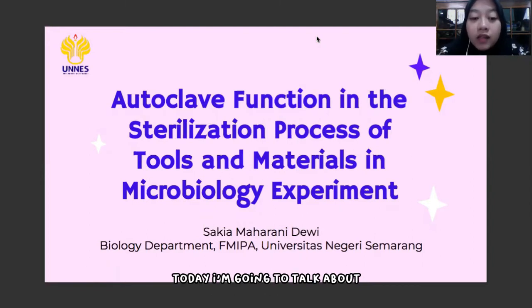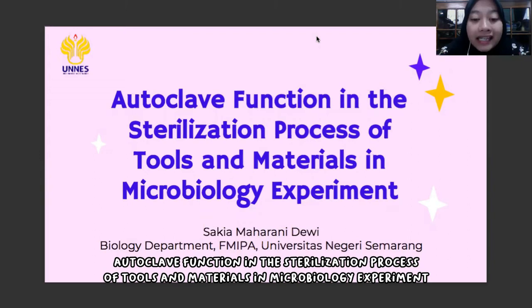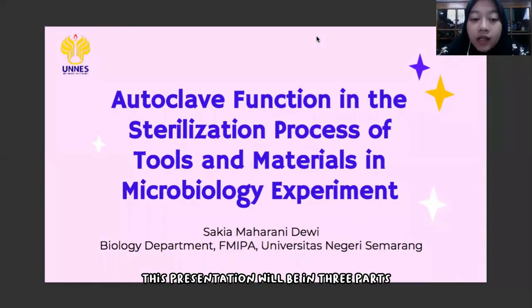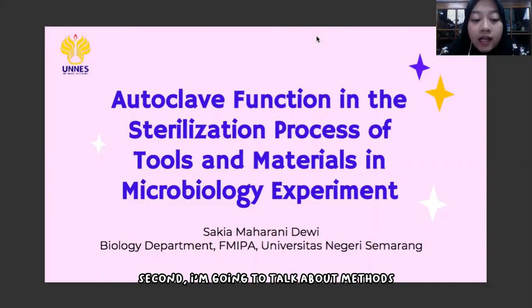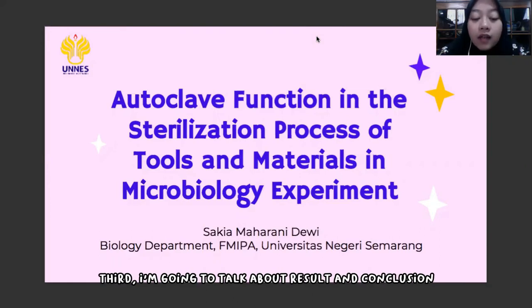Today I'm going to talk about autoclave function in the sterilization process of tools and materials in microbiology experiment. This presentation will be in 3 parts. First, I'm going to talk about introduction of my presentation. Second, I'm going to talk about methods, and third, I'm going to talk about result and conclusion.